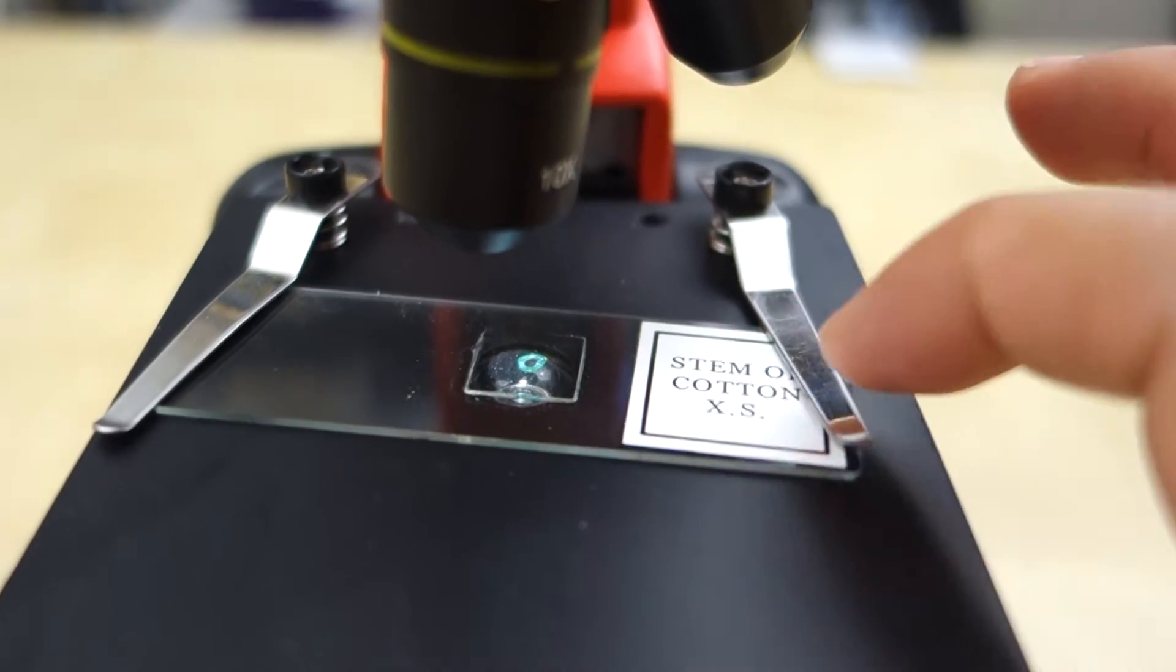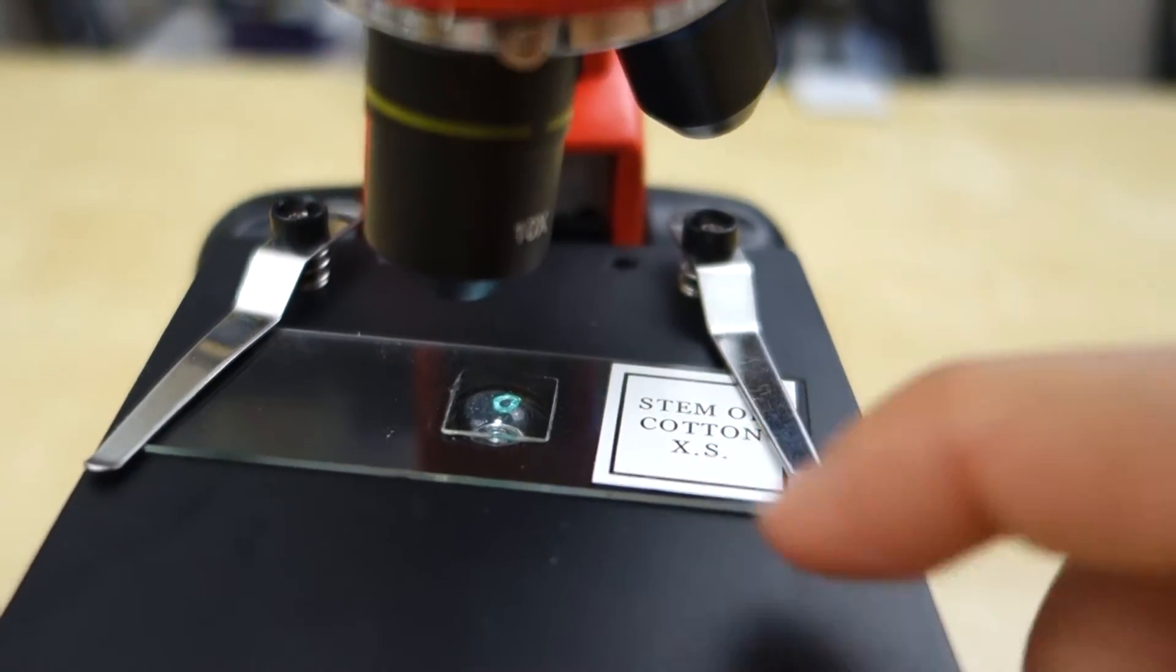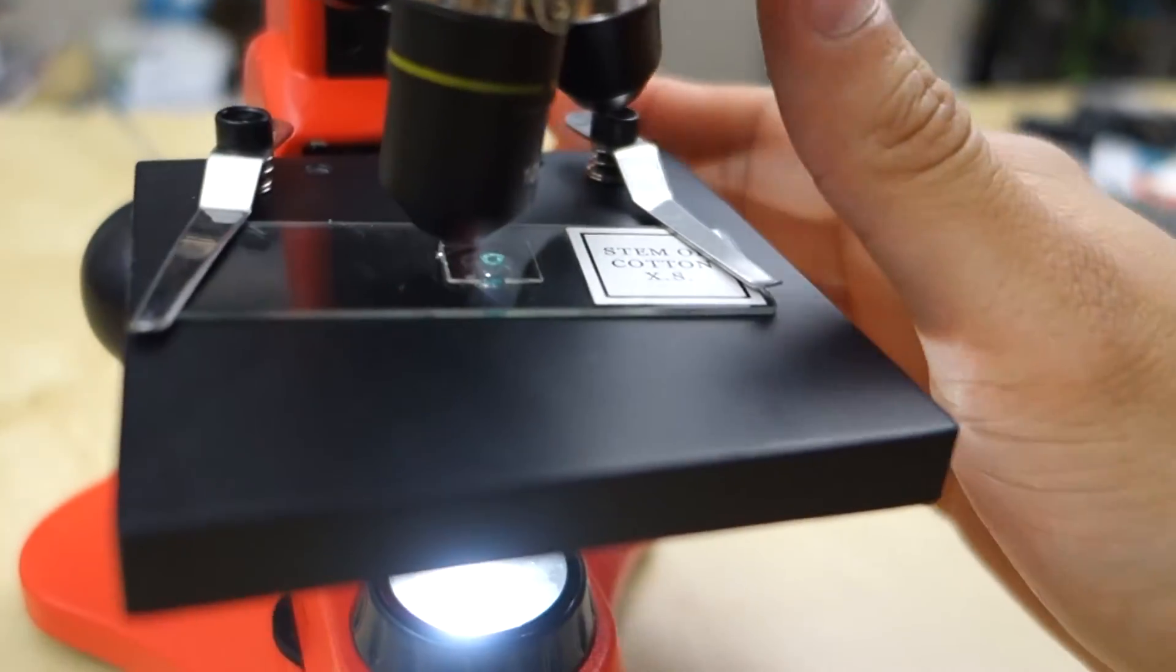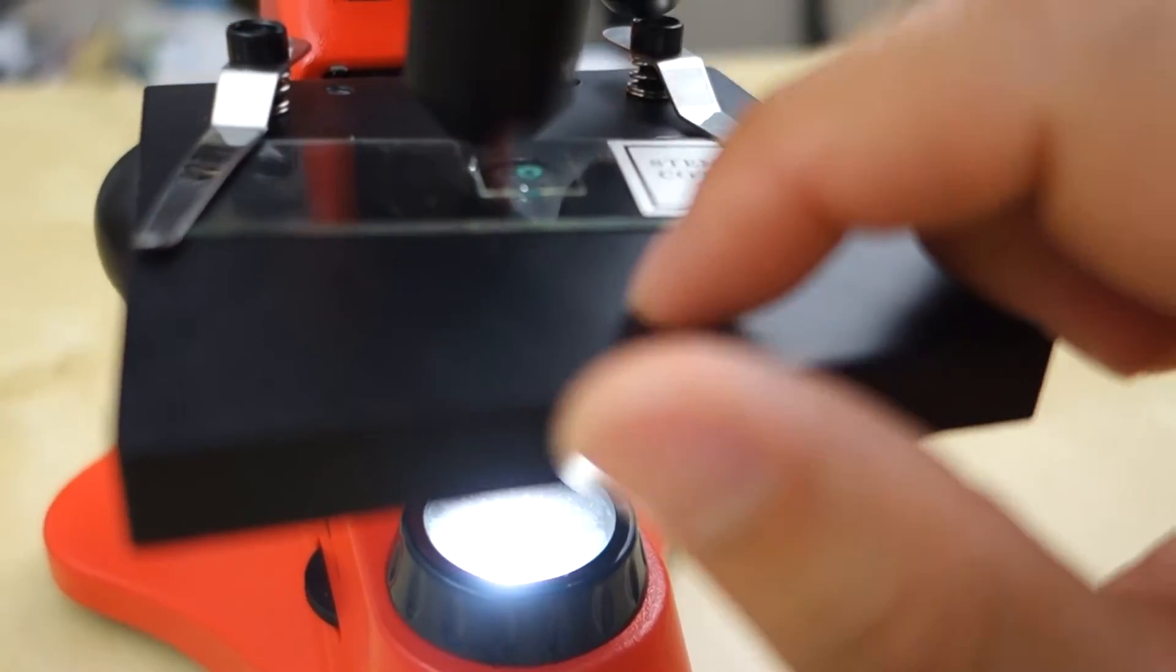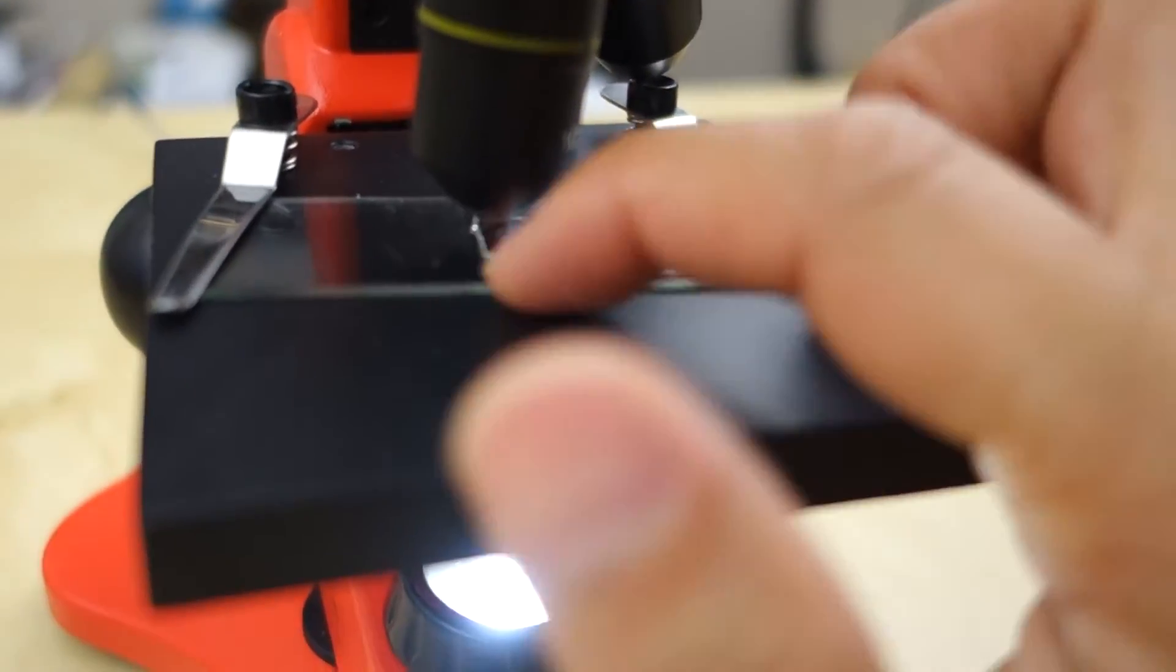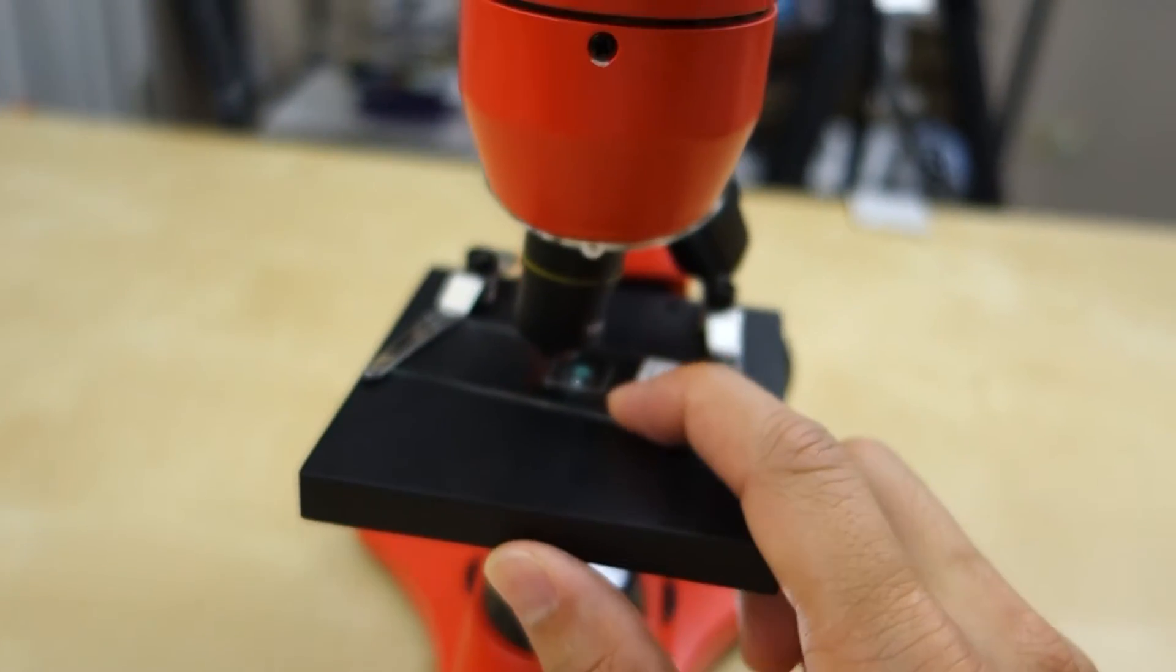So they give you a few of these slides that have stuff already put on it. And you can also add some more because they give you more slides. And then over here you have the knob that adjusts the focus. So when you are using a 40x, I found that in order to get focus, you pretty much have to have the lens here touching the glass pretty much. So definitely you want something on a very flat surface.